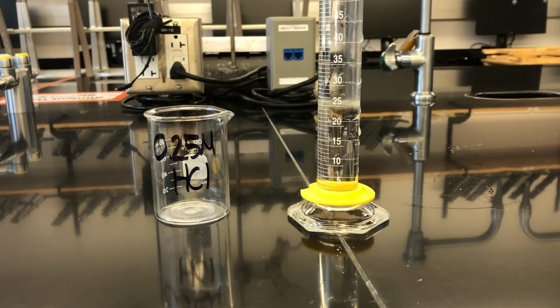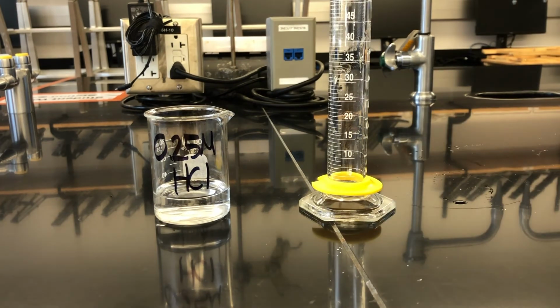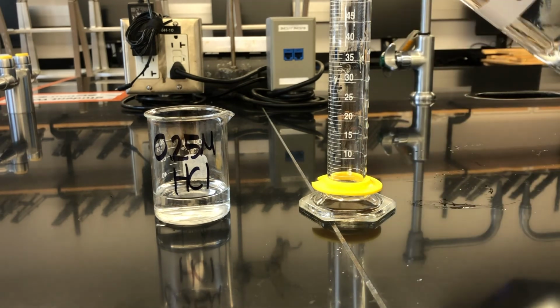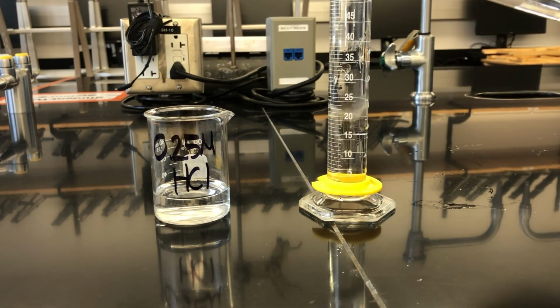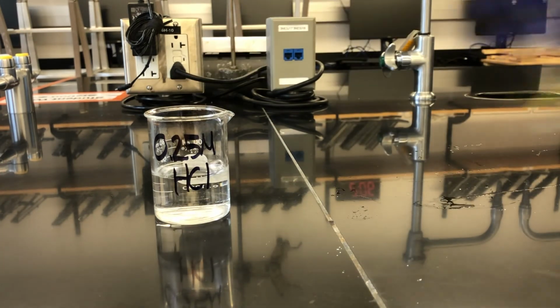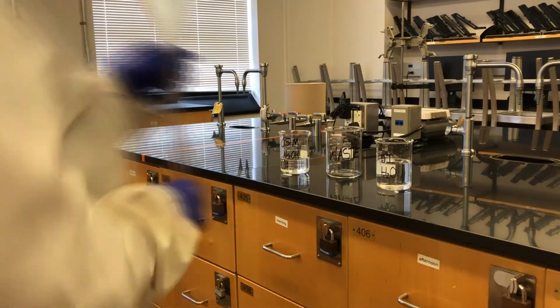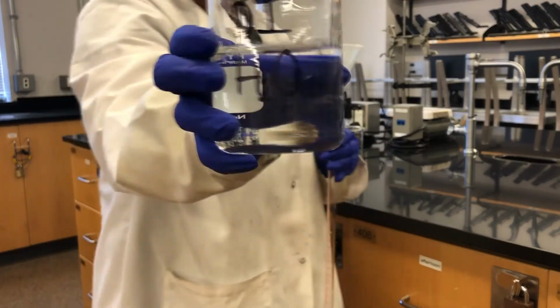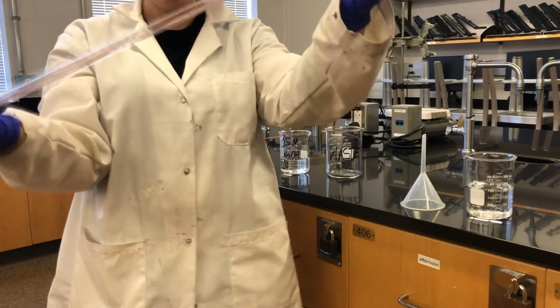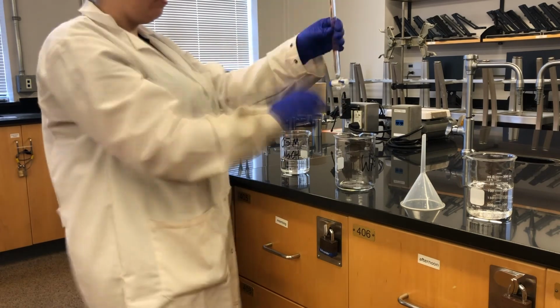For the last part, we prepare 50 milliliters of 0.25 molar hydrochloric acid by measuring 25 milliliters of deionized water into a 100 milliliter beaker, followed by 25 milliliters of 0.5 molar hydrochloric acid stock solution. We again have to re-prepare the burette with our new titrant, so we dispose of the old solution, and then recondition the burette twice with deionized water, and then twice with 2 small aliquots of our freshly prepared 0.25 molar hydrochloric acid solution.